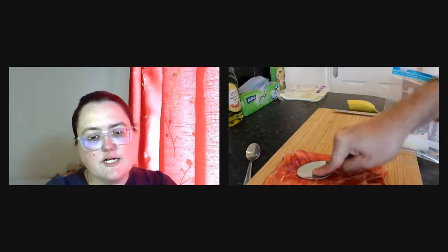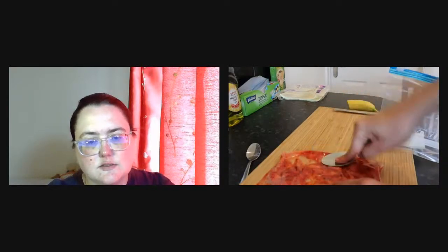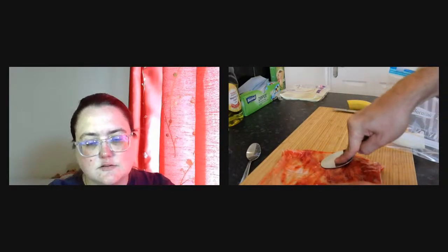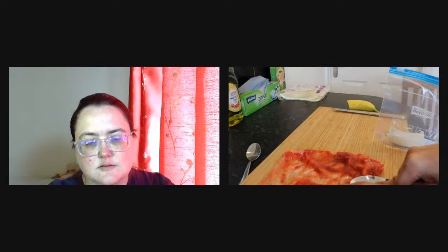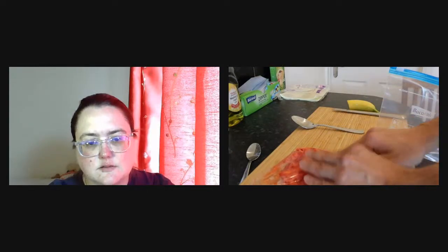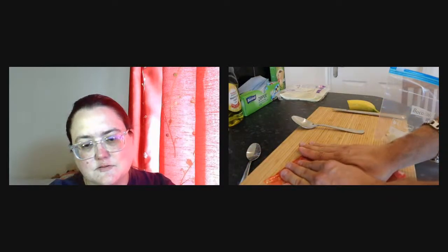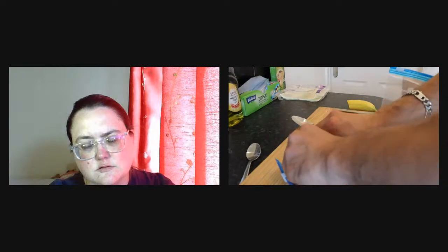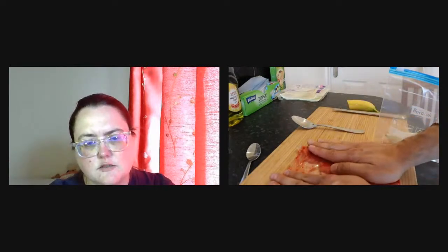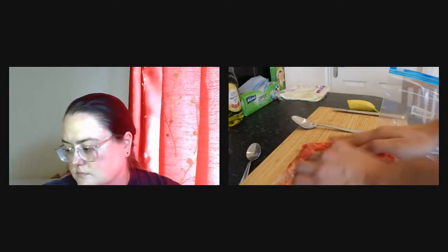That may be easy because you really don't want to break the bag, do you? No, we don't want to break the bag. It's not a problem if you break the bag, you're just making a mess. But if we can avoid making a mess, that would be good. What I want is really to have a homogeneous mixture, so everything should look the same. I want as few big chunks as possible.